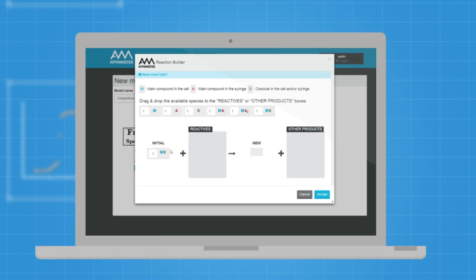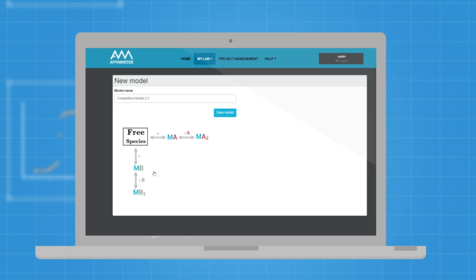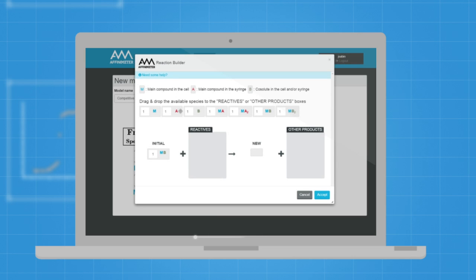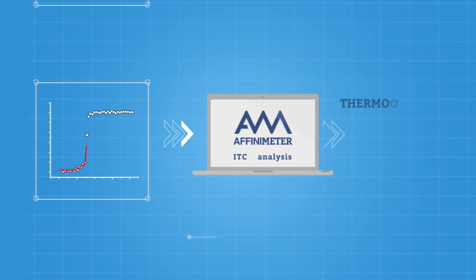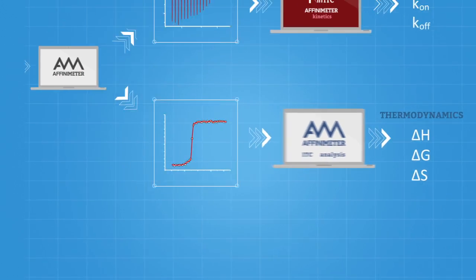It also provides an easy to use tool to allow users to create original binding models. Not having the right binding model to describe a system will no longer be a reason not to analyze your isotherms.